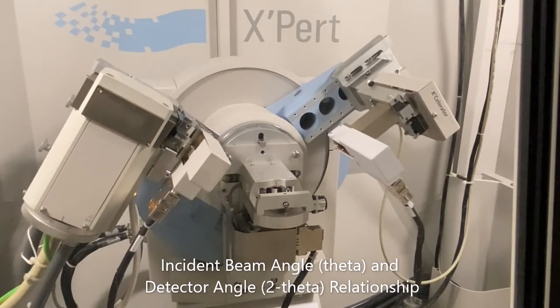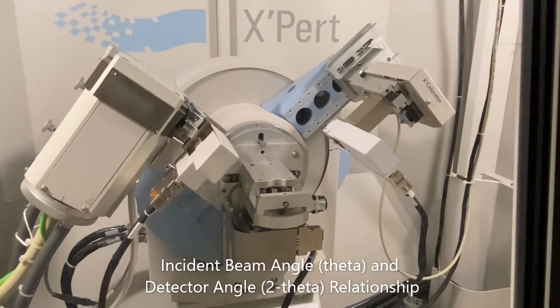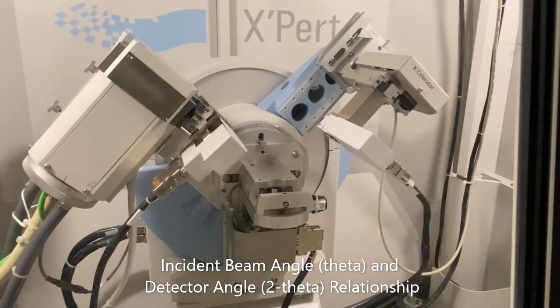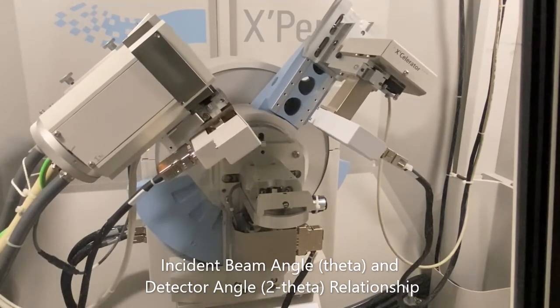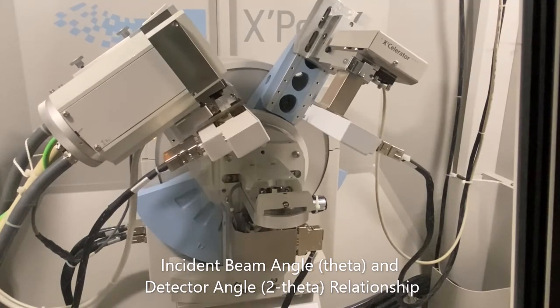So when theta is 10 degrees, 2 theta is 20 degrees. Then as the source rotates clockwise upward during the X-ray measurement, the detector will rotate counterclockwise upward, so they maintain that relationship between theta and 2 theta between their positions.